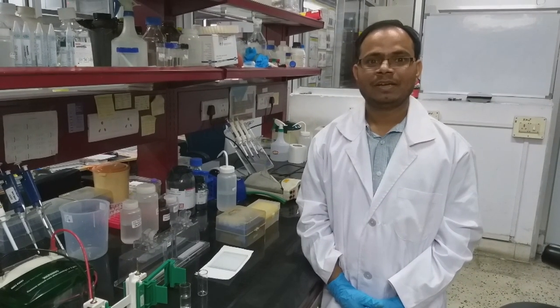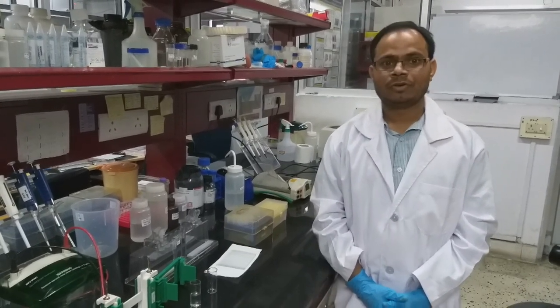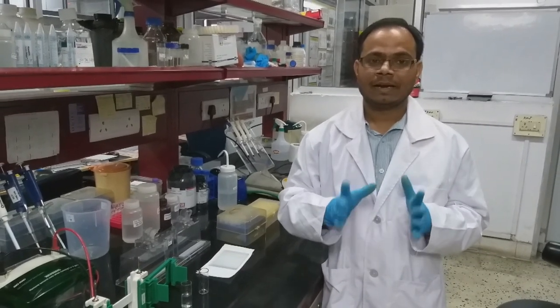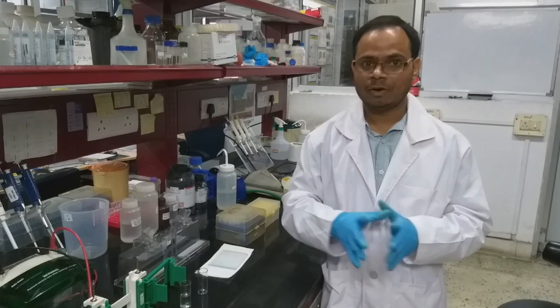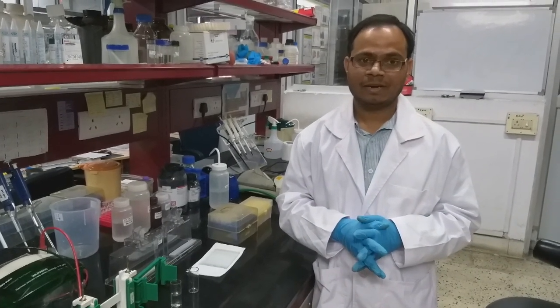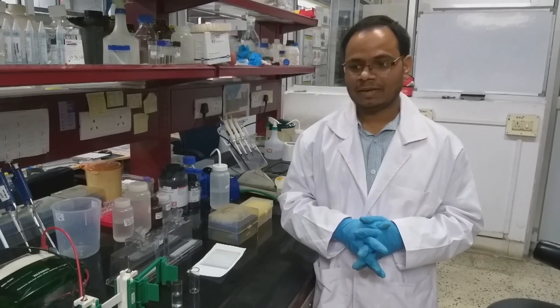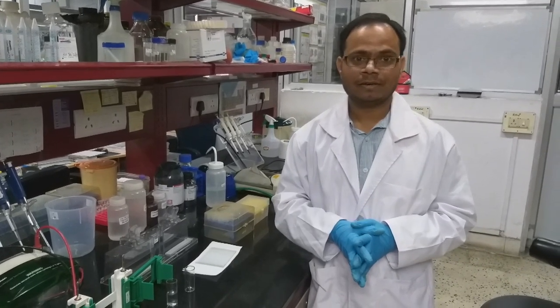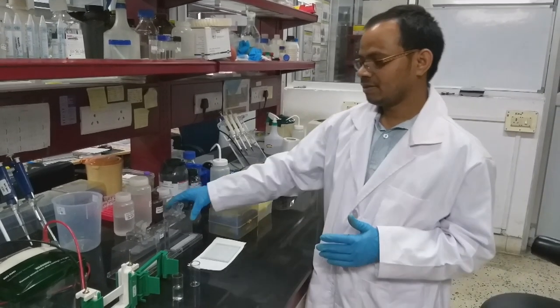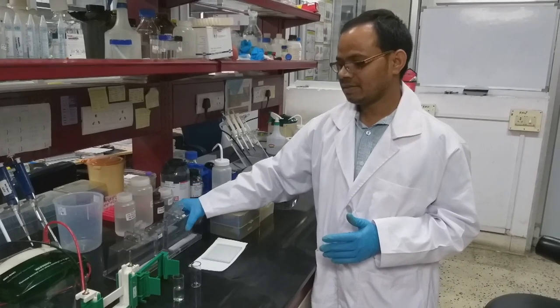Hi everyone, myself Suram Banesh, research scholar at Department of Biosciences and Bioengineering at IIT Guwahati. In this video, we will demonstrate how to run an SDS-PAGE gel, how to prepare various reagents required for the running of SDS-PAGE gel, and what are the different instruments we can use.